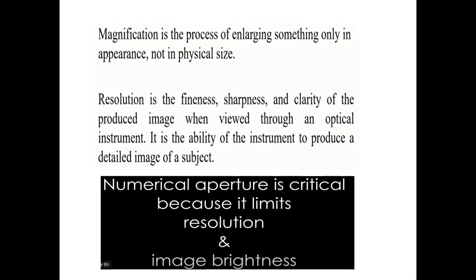That is, the object or the specimen you have kept under the microscope is still the same size. The physical size is not changed, we are only enlarging it, and this process is known as magnification. Then what about resolution?